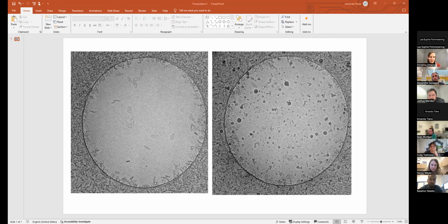Great. Do you think maybe replace the O-ring on the holder, just to rule that out? Possible. I guess the vacuum would crash if that was the problem. Yeah, or it would go down super quick. Yeah, we haven't had any crashes on the vacuum.